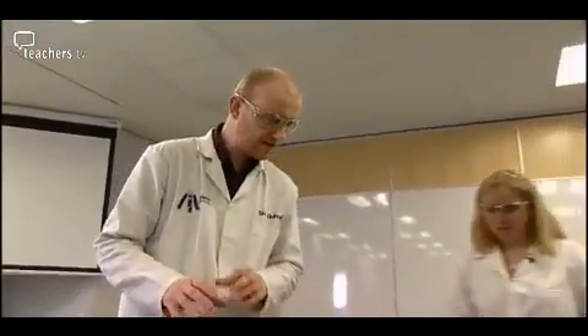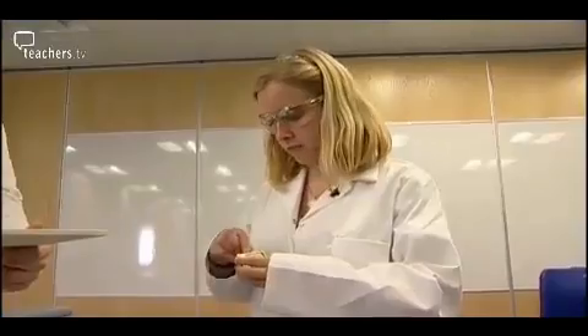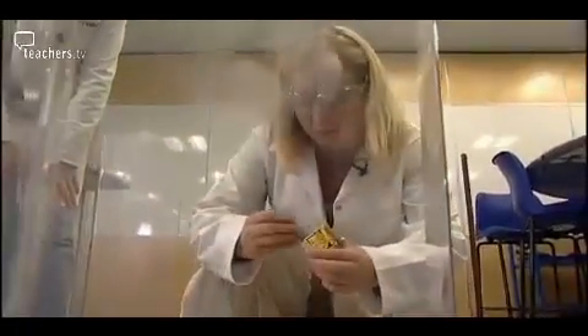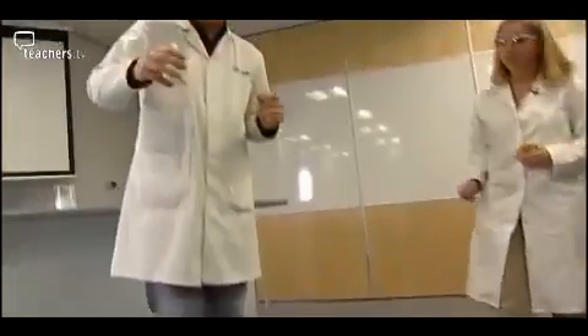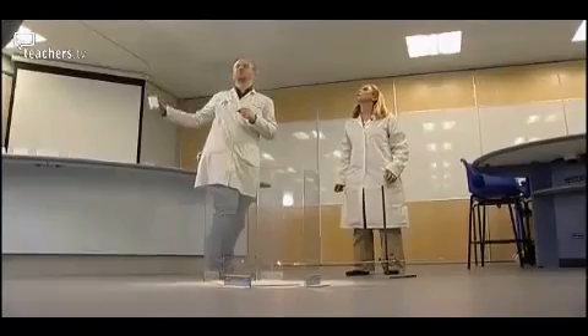Here we have a really nice demonstration that shows the effect of particle size and surface area. We've got an everyday item — coffee whitener. Try to light it with a match and you can see it's not catching alight. What we're going to try now is to actually catch it alight using a lit splint, which is the safest way to do this demo. Safety screens are sensible too. Just gently shake the powder over the flame — and you can see there are convection currents coming up with it because of the heat. Be careful not to let the flame sweep your hand.